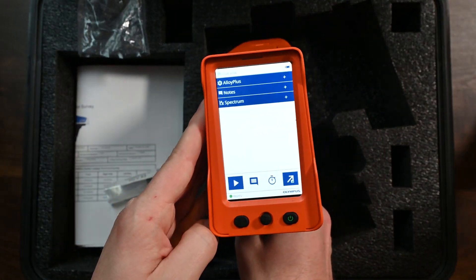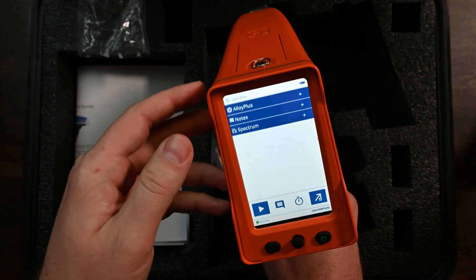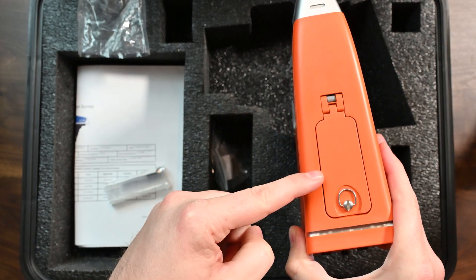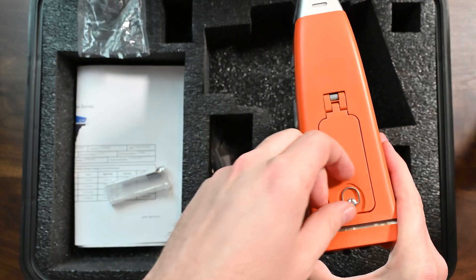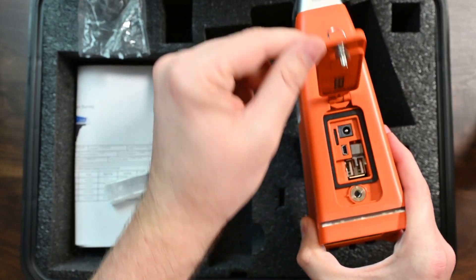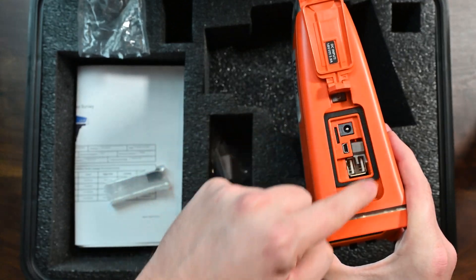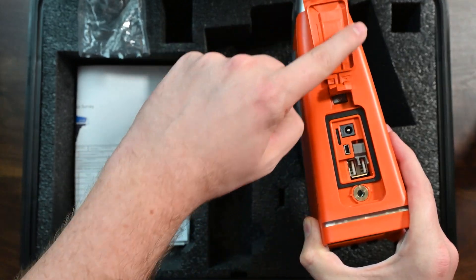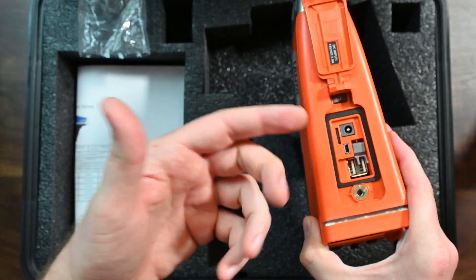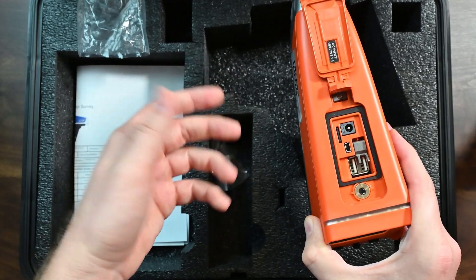The analyzer is already powered on and it looks really straightforward. We're in alloy plus mode, as you can see there. Let's take a look at the top of the analyzer — this is the access hatch. There's no more crappy rubber boot that kind of floats around. What you end up with is this hatch: you turn this finger screw a couple of times, open up the hatch, and you're left with a nice port in the top with a sealed gasket and a nice piece of plastic that mates up to that gasket and seals the ports shut. I think it's a smart design — it looks a little clunky, but in practice it works very well.